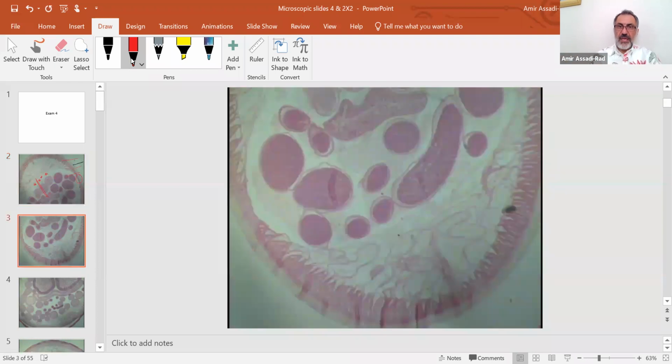Okay. And same thing again, lateral line on this side. And of course, testes, you can see all of the testes. This is the intestine right here. And these are all testes, pseudocoelom area, longitudinal muscles, all of it, longitudinal muscles, and that would be your cuticle, the tegument, hypodermis.